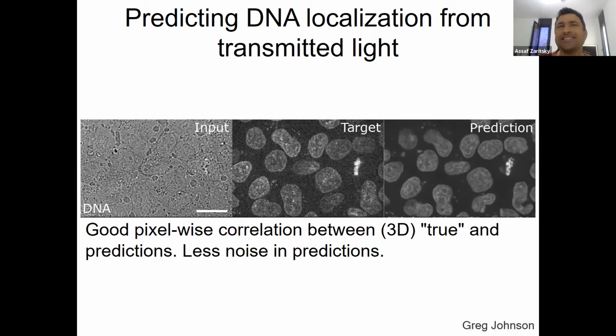Why do you think the prediction is less grainy? Yeah. The contrast is bigger in the prediction. No, it removes the stochastic noise, maybe.